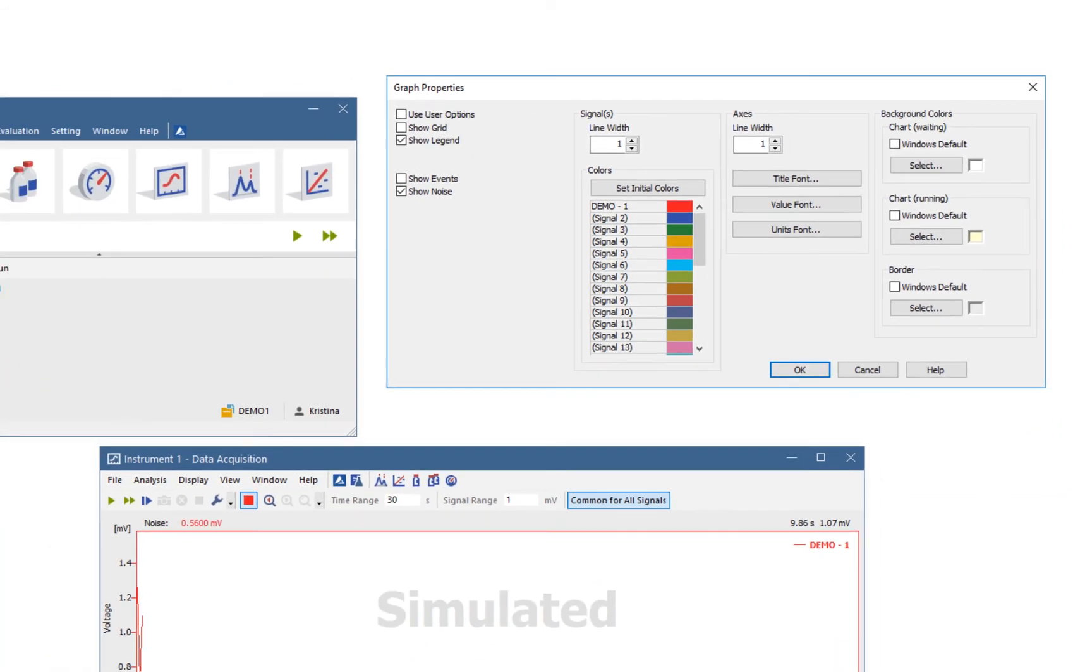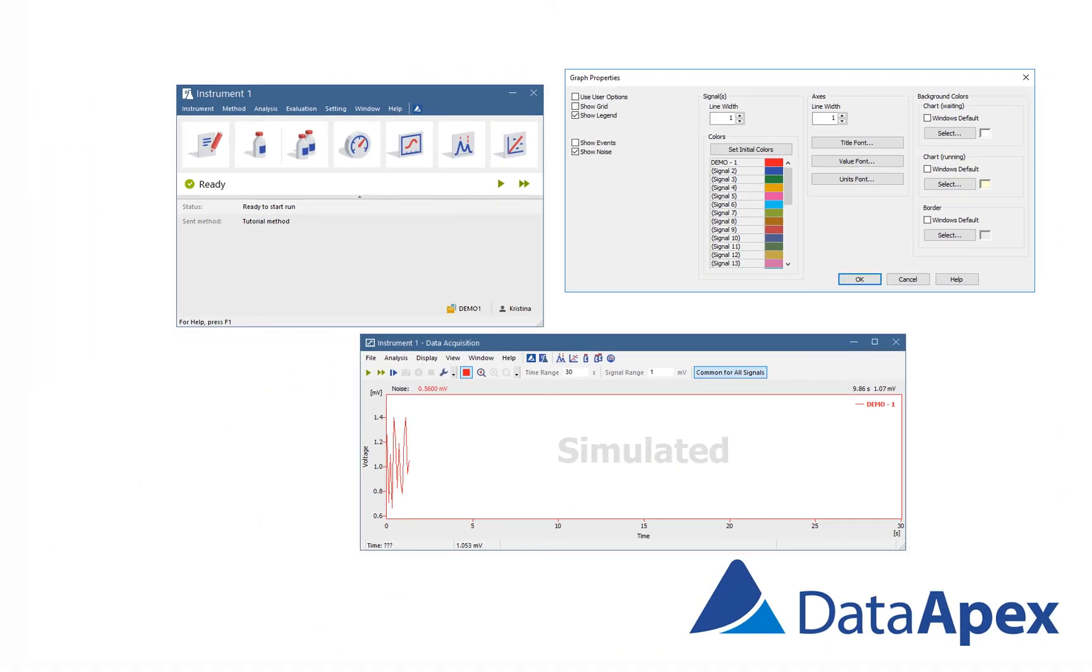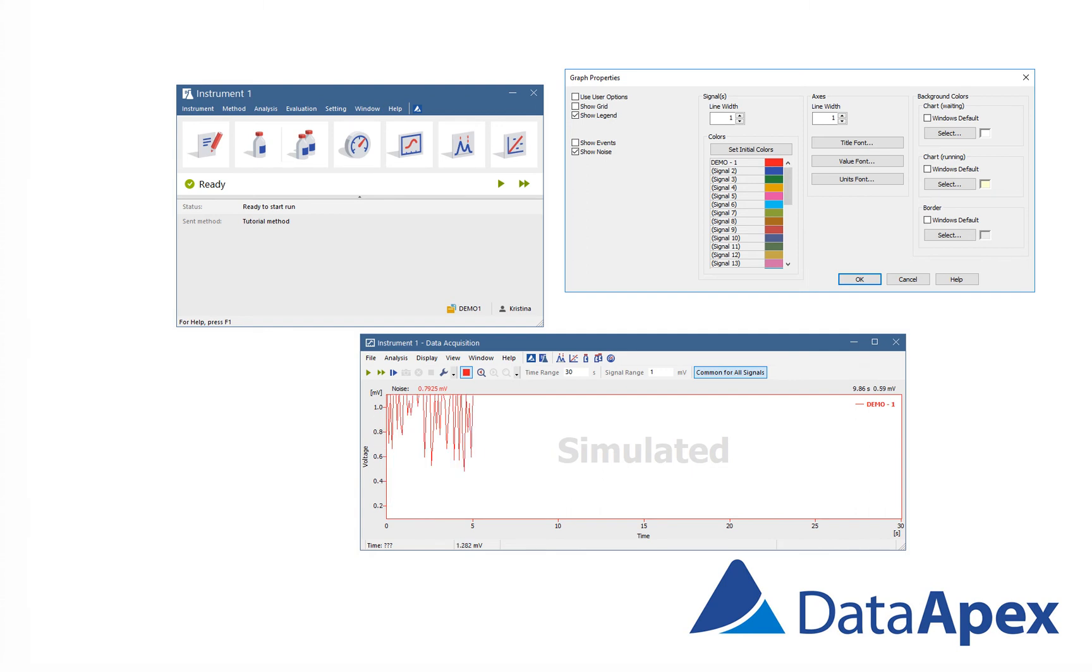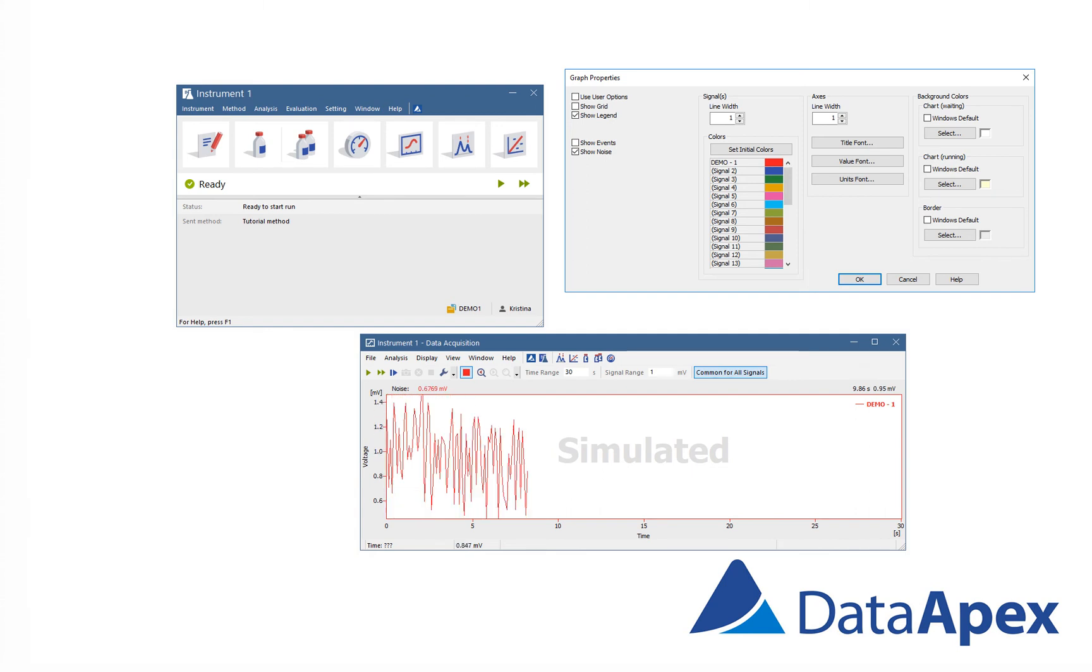And this is basically how to watch real-time signal, change axis and respective ranges, how to zoom part of the signal and how to change graph properties.